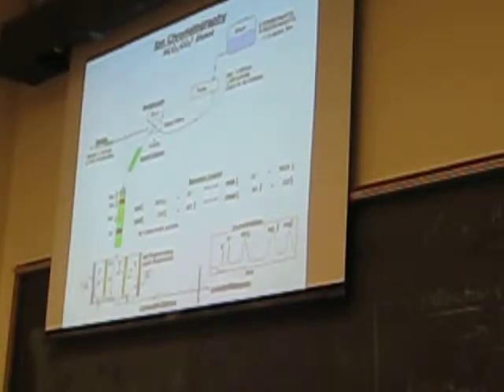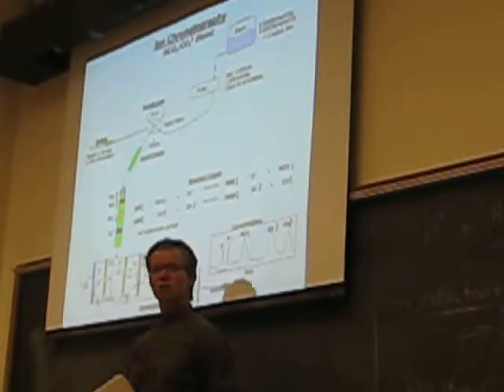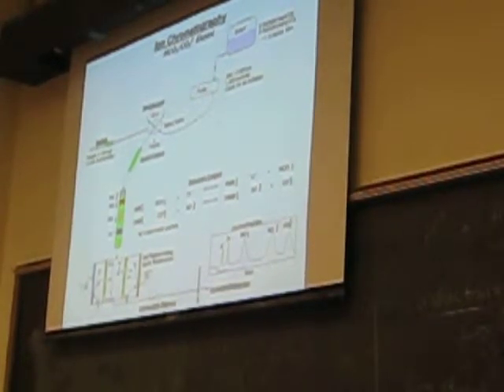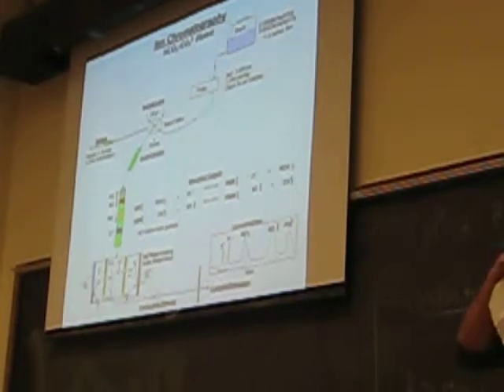What's the guard column made of? It is packed with the same material that's in the analytical column. So it's packed with a stationary phase that has quaternary ammonium functional groups on it. Why is that one much cheaper? Because it's really tiny. It's small, it's not this big, and the analytical column's not that big.